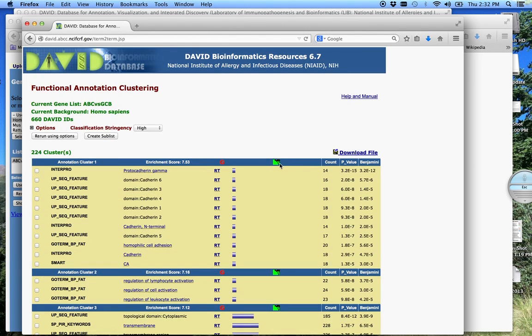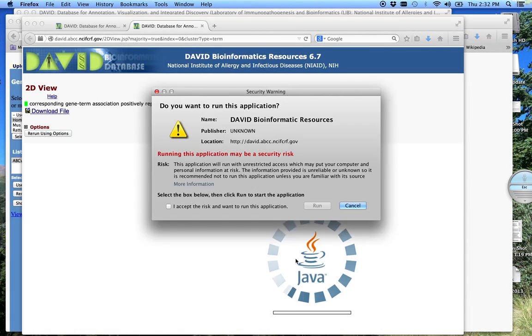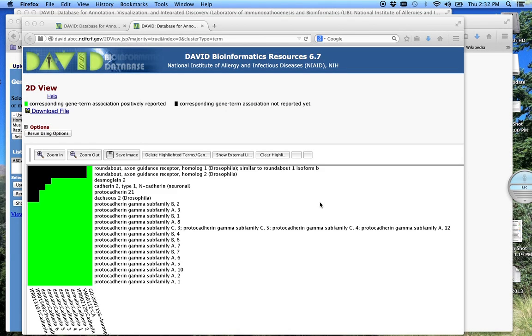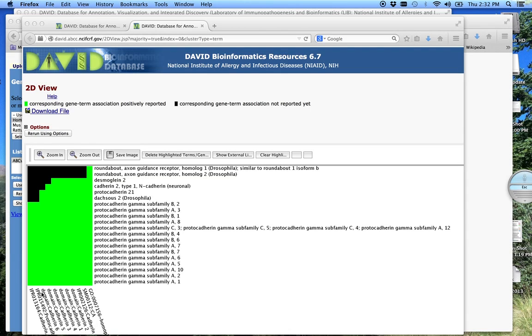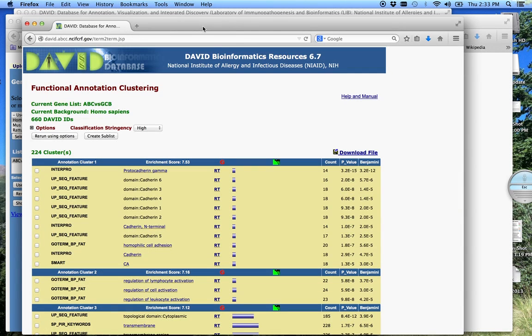And just like the gene level analysis, we can look at a 2D version of the clustering. Yes, I accept the risk. And this is just a Java program. And again, so all our functional categories this time are on the bottom. Now our genes are on the top. So anything with a green means that these particular genes are associated with this particular functional category. And black would mean that it is not. So it has grouped all of these genes together, or grouped these functional categories together based on the occurrence of these similar genes. And again, we can download any of these files that we want.